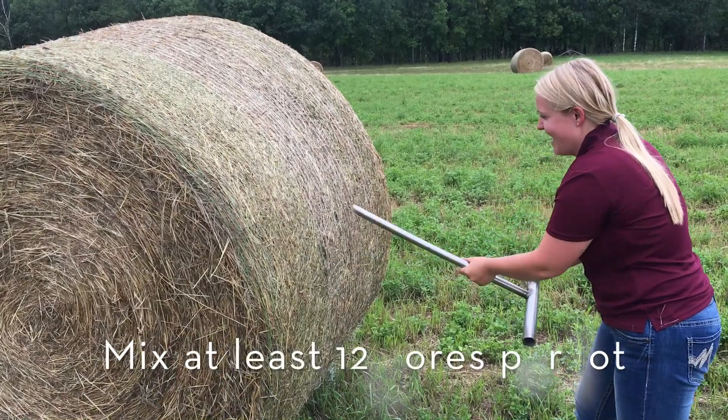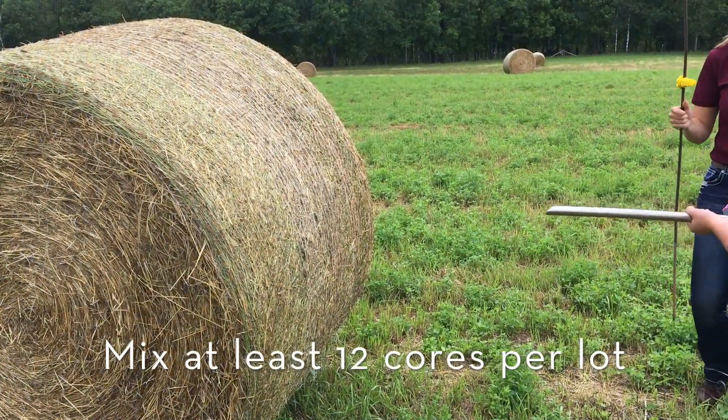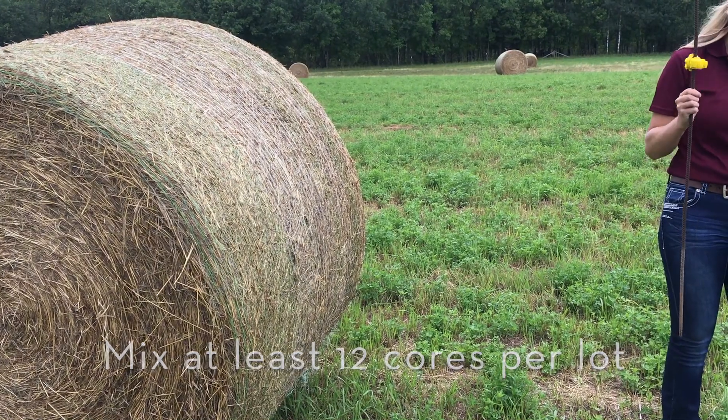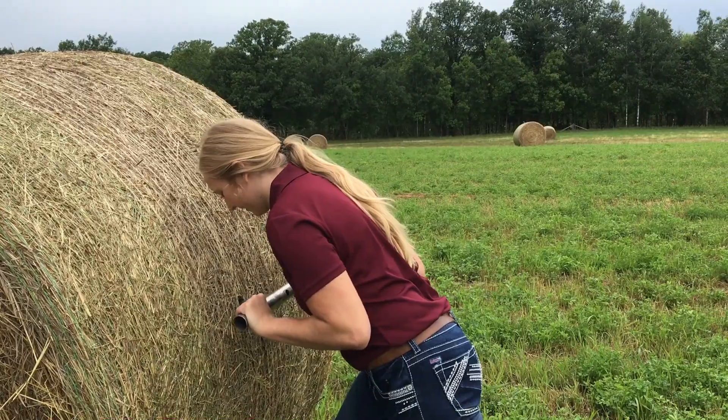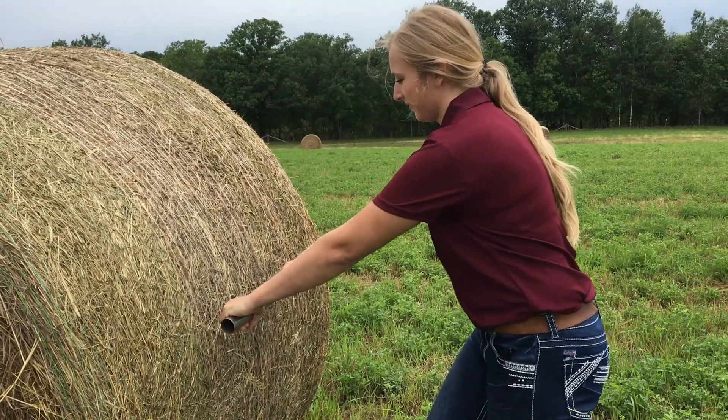To get a representative sample, it is important to mix a minimum of 12 cores per lot. A lot is a group of bales that are expected to have similar nutrient composition — for example, all of the bales from a single field harvested on the same date.